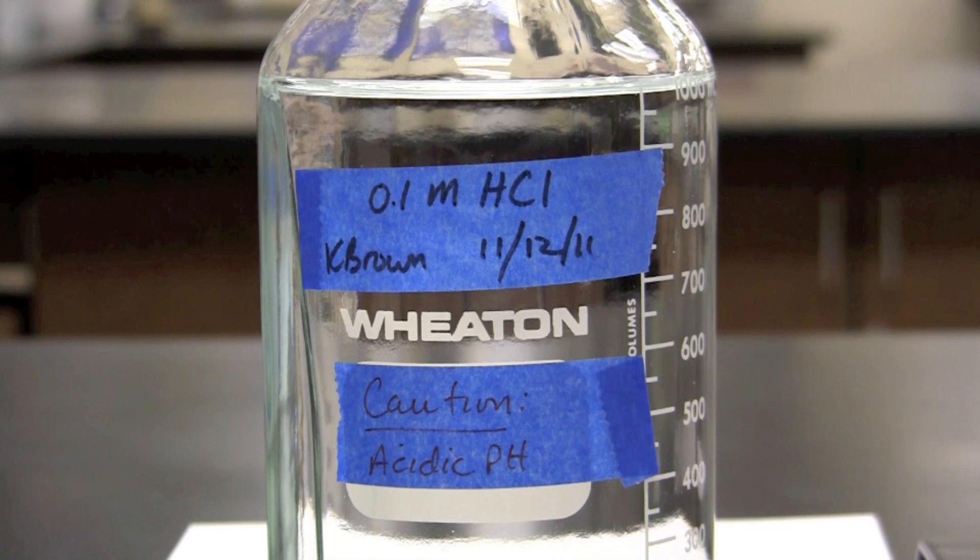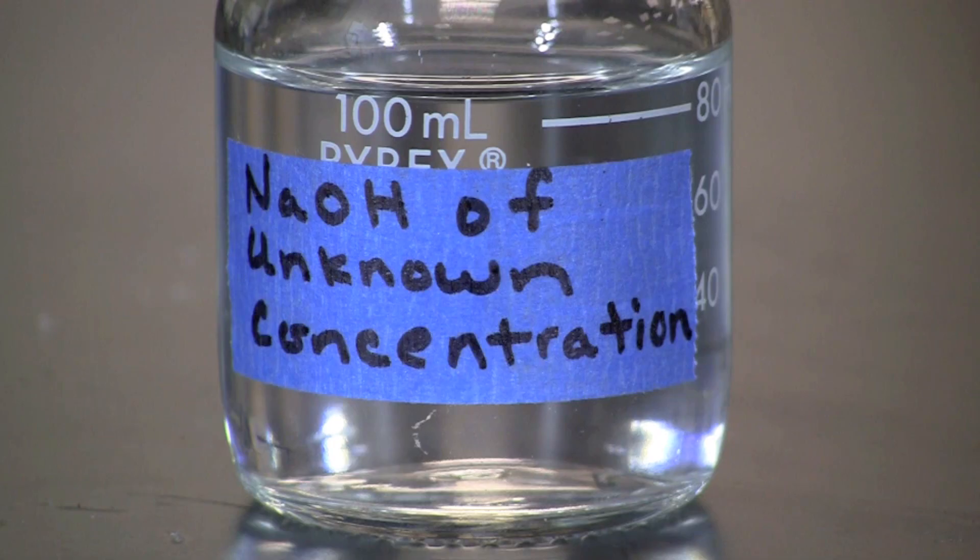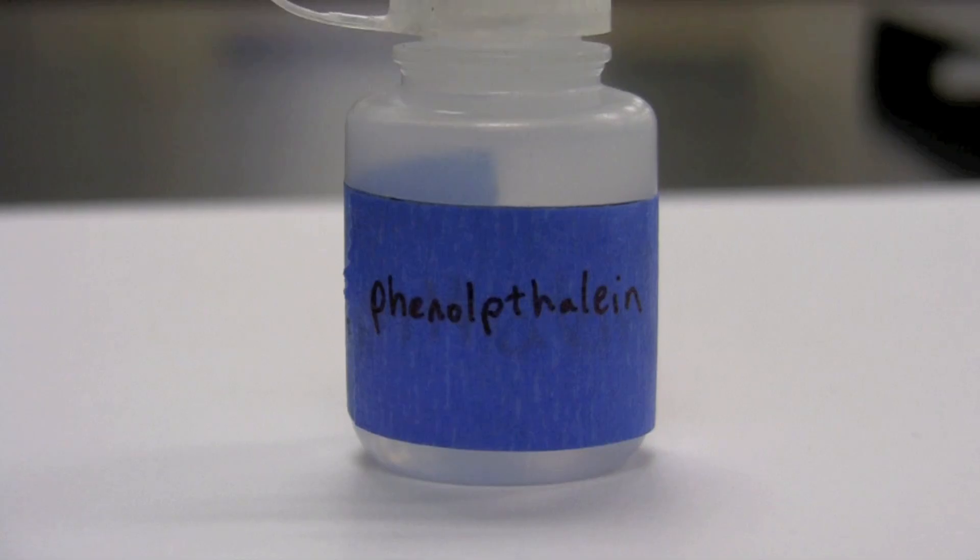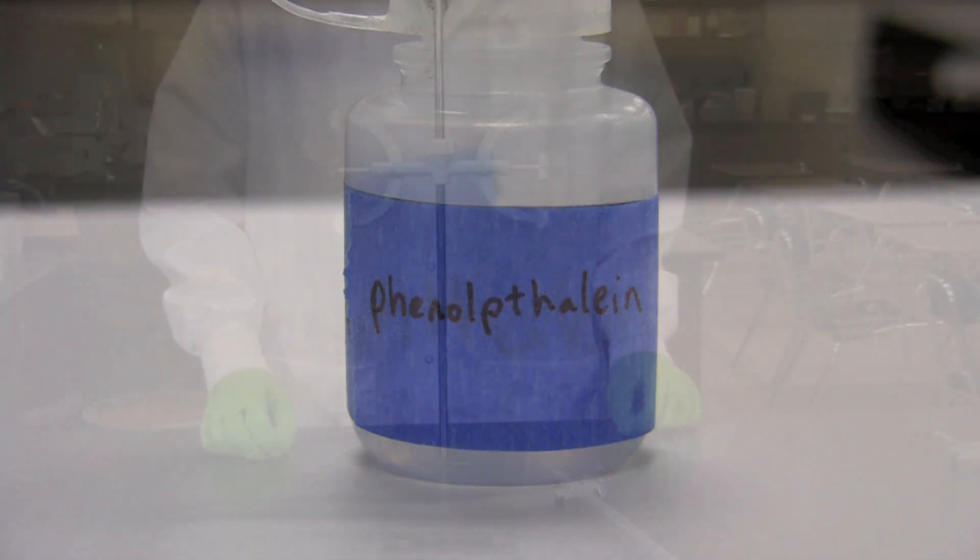For this titration we will be using 0.1 molar hydrochloric acid to determine the unknown concentration of a sodium hydroxide solution. The progression of the reaction will be determined using phenolphthalein, a pH indicator that is colorless in an acidic environment and pink in a basic environment.